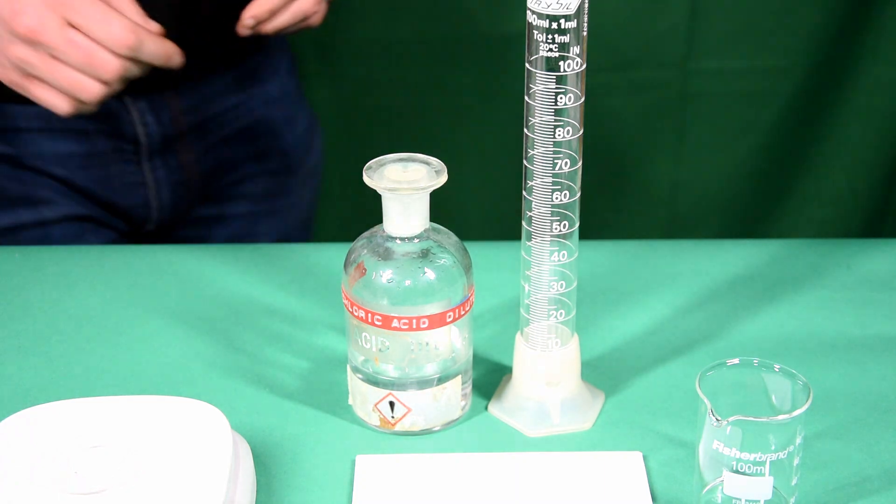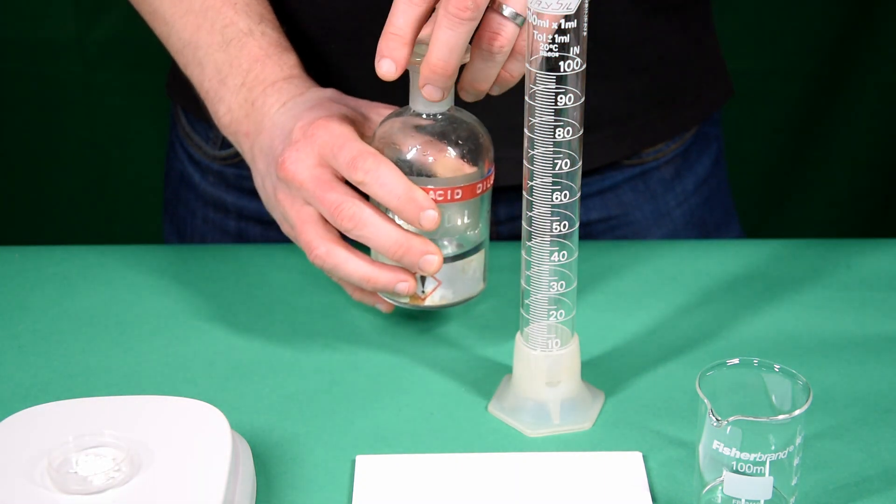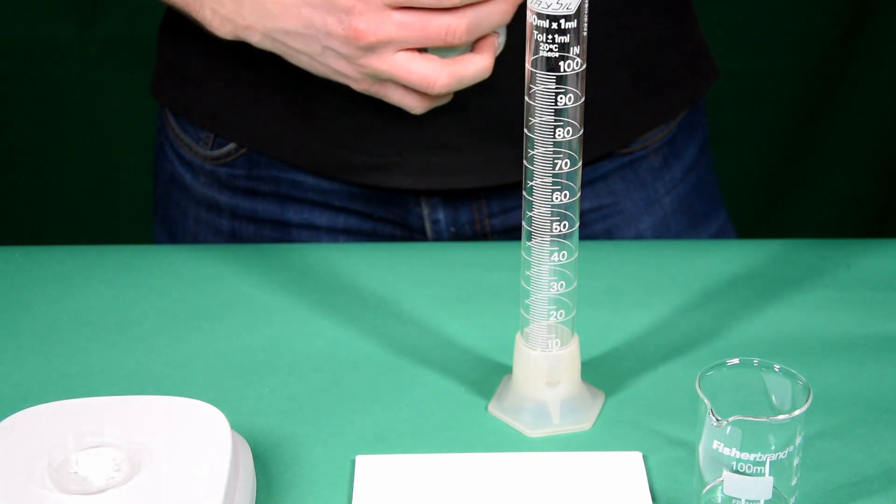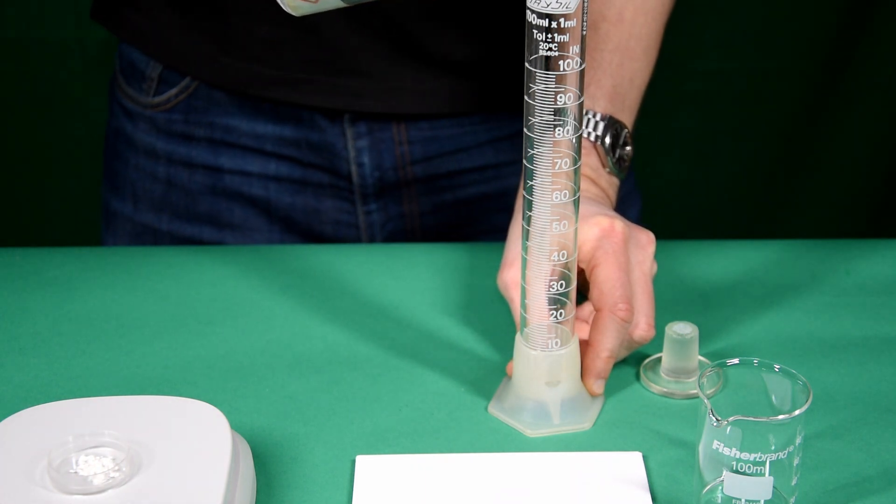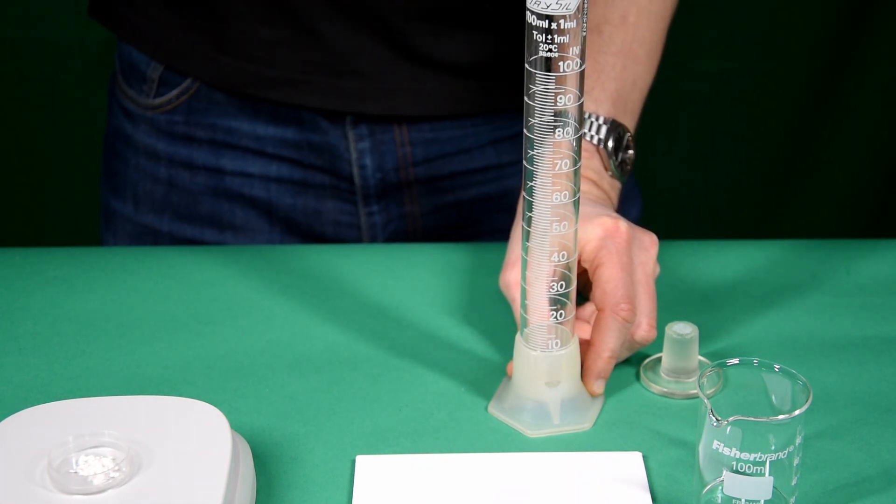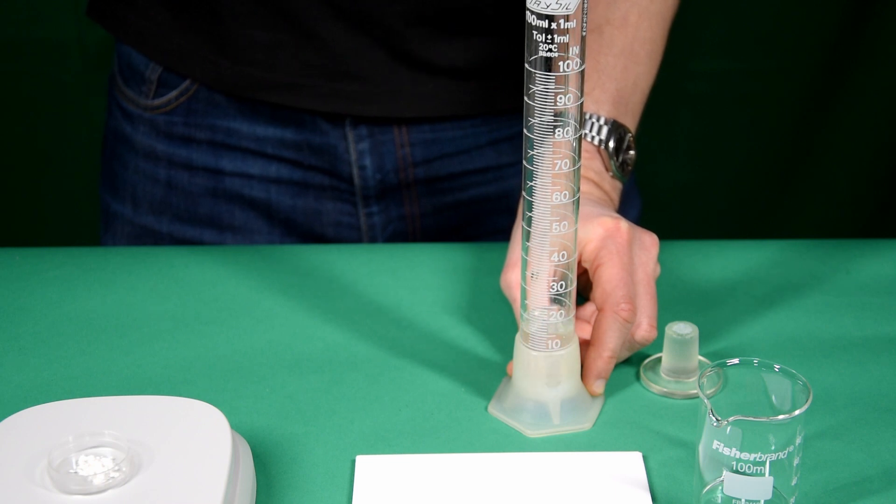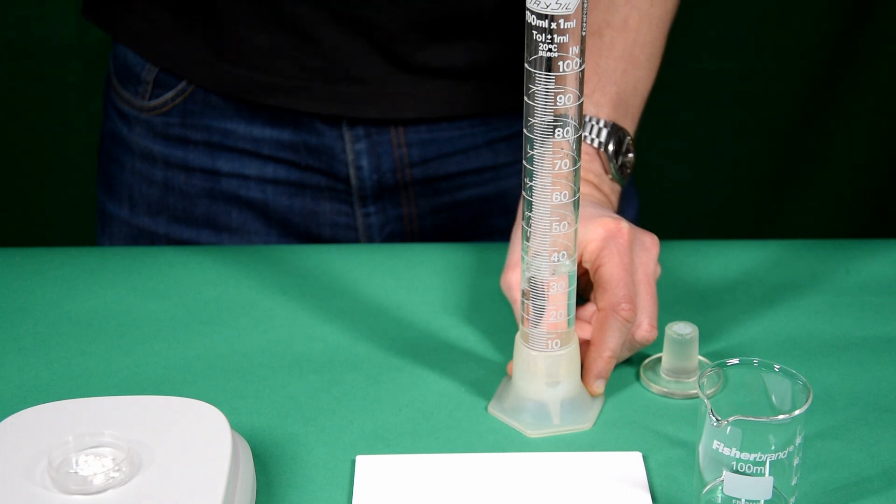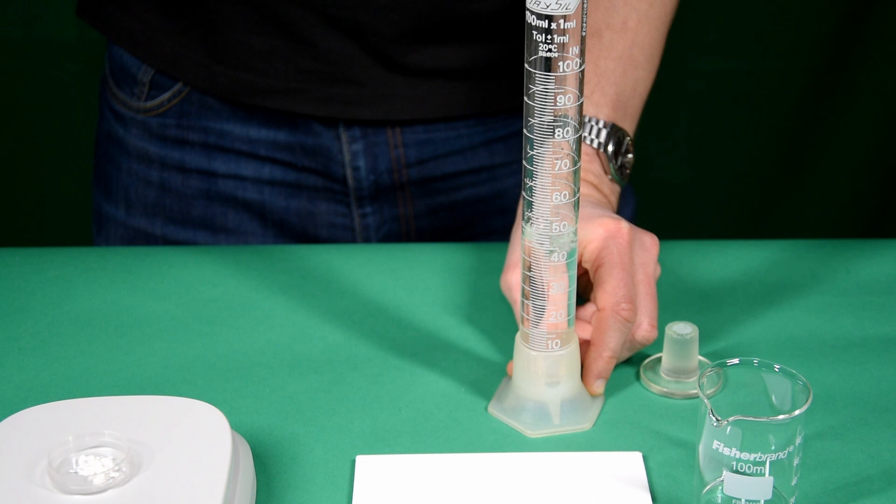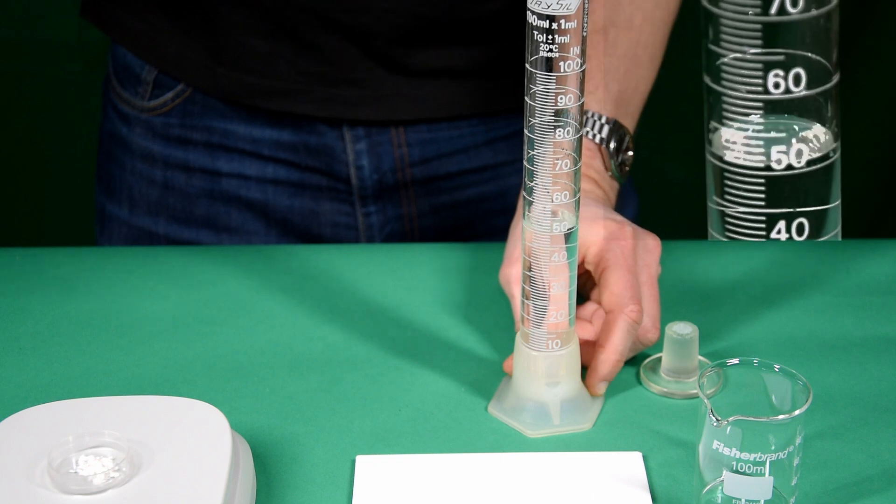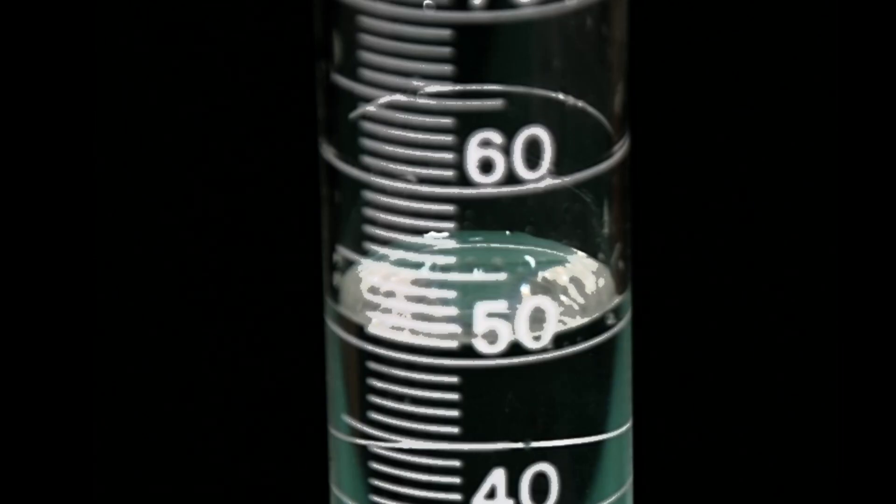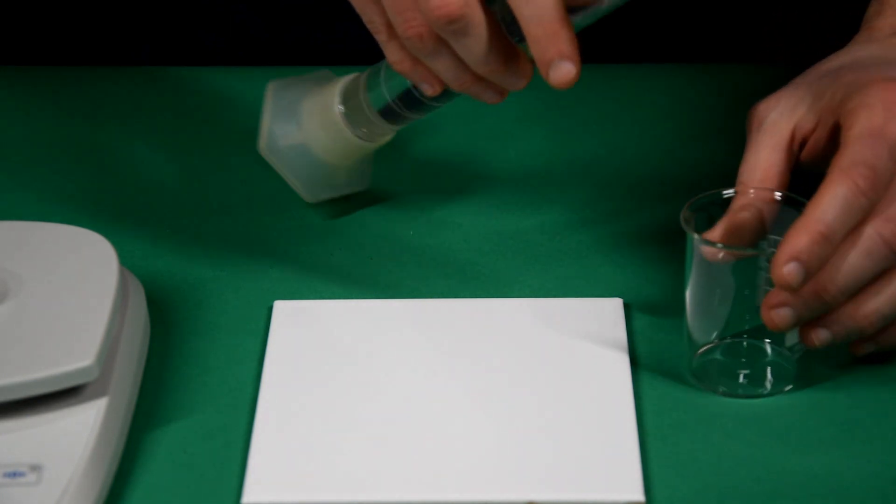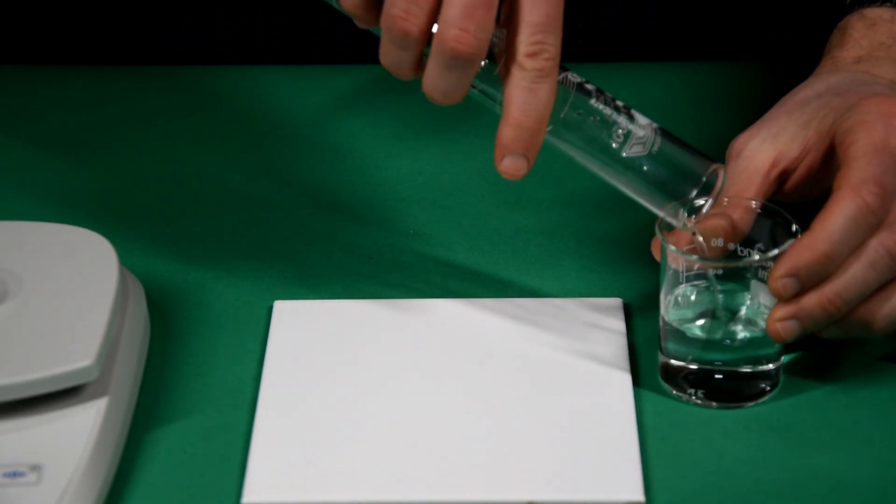And we will need 50 cm cubed of hydrochloric acid. Now this could be measured using a measuring cylinder, as we will do, but also using a burette or a pipette. We add the acid to a beaker.